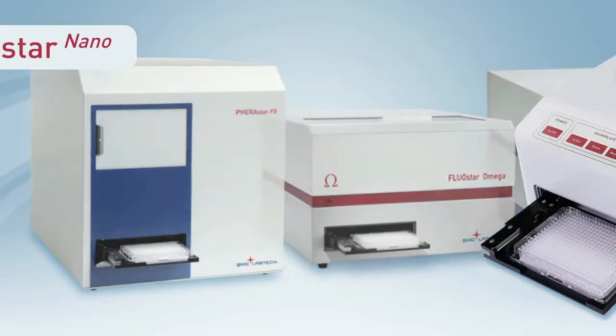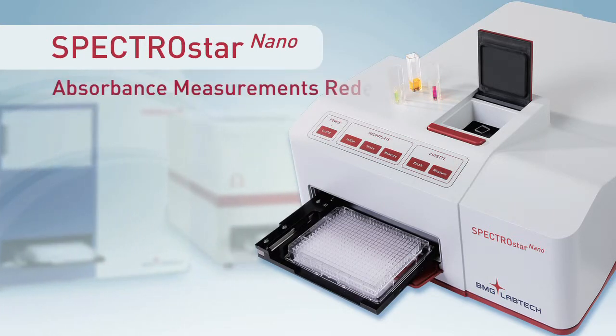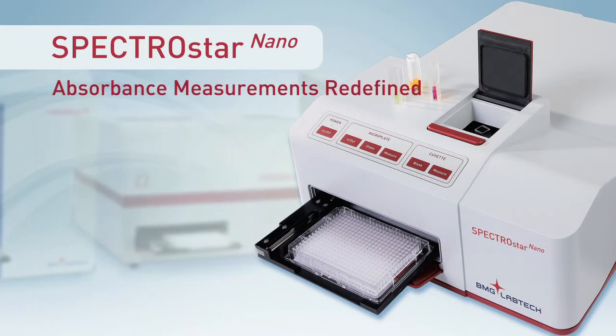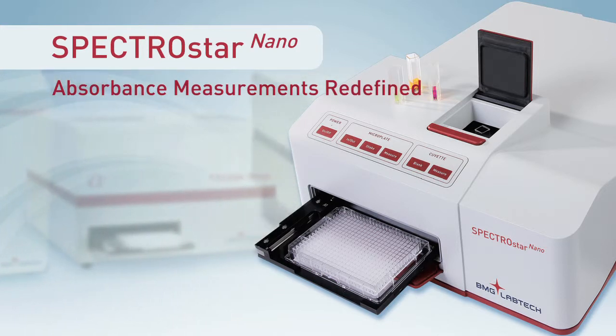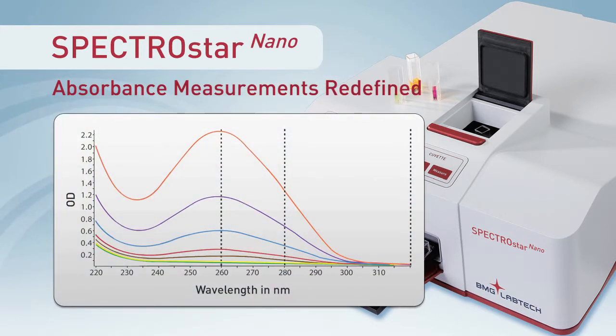BMG Labtech is proud to introduce the SpectroStar Nano, an absorbance spectrometer that allows you to easily and instantly capture a full absorbance spectrum for low-volume samples, microplates, and cuvettes. The SpectroStar Nano is a revolution in absorbance measurement.